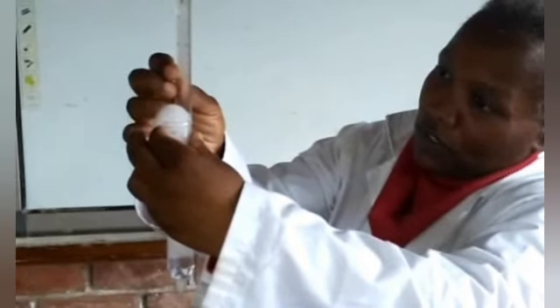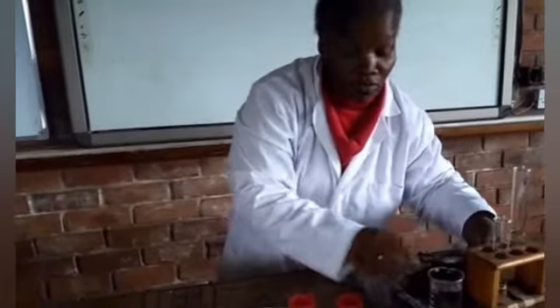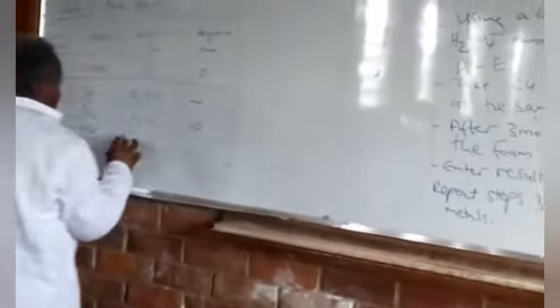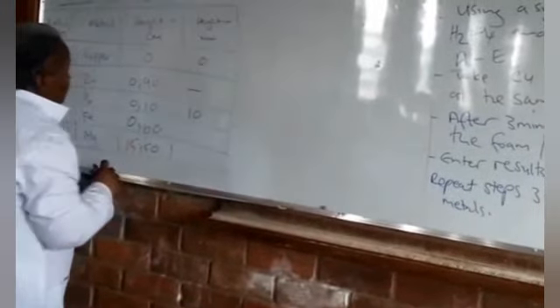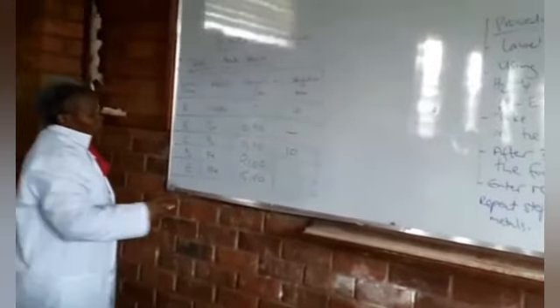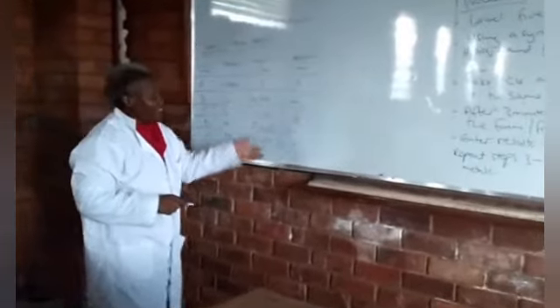Okay, I need more light. Okay, it's not yet 20, this is 10, 11, 12. So that is the 13th mark. So about 14, 15. Okay, 15. But I'm sure you can see that you can even put more than 15 because some has already spilled over. Iron, we got 0.60, in this one we got 15.50. So, convert into millimeters.